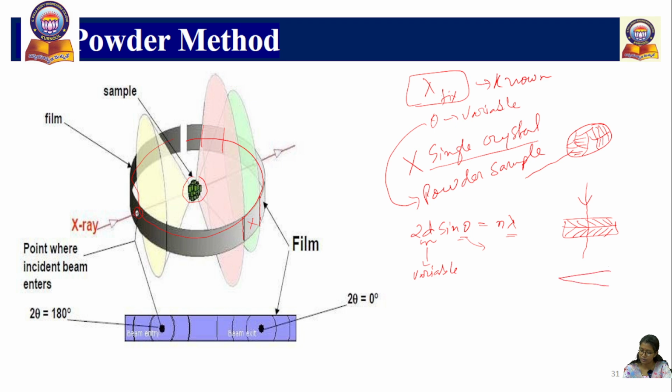If you have an arc of a circle, if this is the radius, and this is the angle made, theta, then theta equals arc by radius. This formula is known from class 9 or 10 most probably. So that simple thing only we will use here.